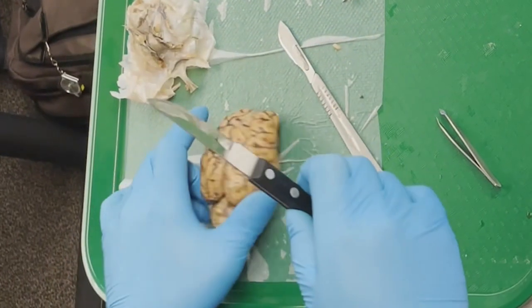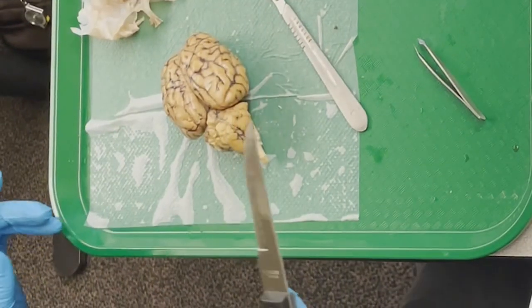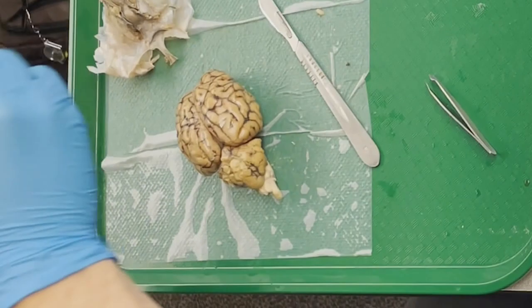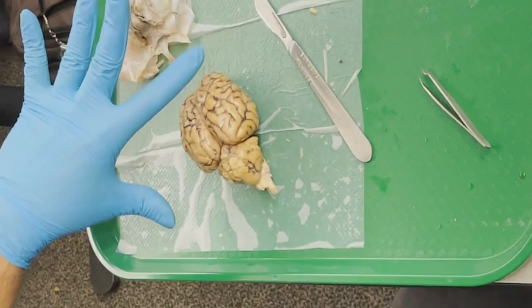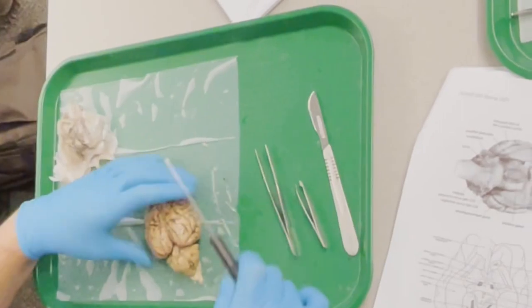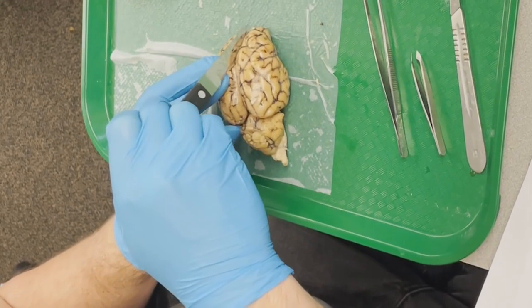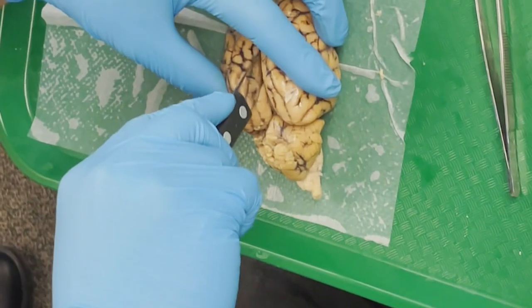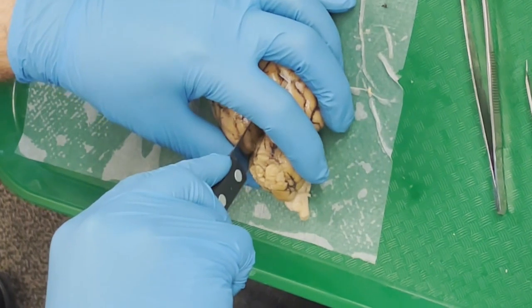When we are trying to make this cut, you'll want to do it with one of the larger blades, so either the box cutter or the knife I've provided. And instead of sawing, you want to actually try to just press it all the way down and then drag the blade all the way through. So you'll aim from the front. Feel free to come closer if you need to. I'm gonna aim between the hemispheres right here at the front. And then I will just kind of drag this backward through the entirety of the brain. You can grab different parts as you cut.